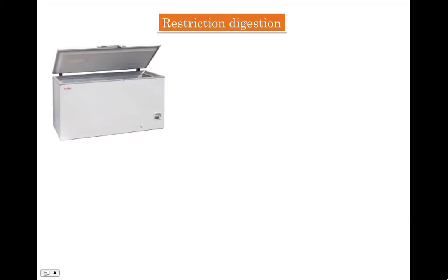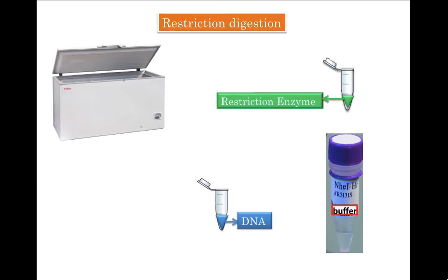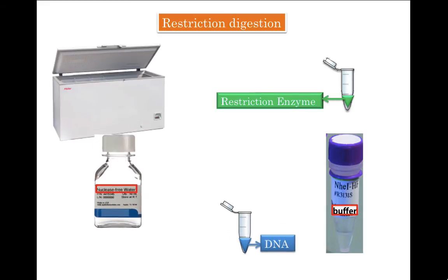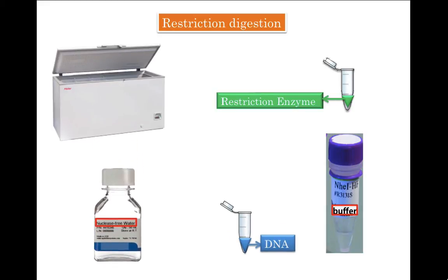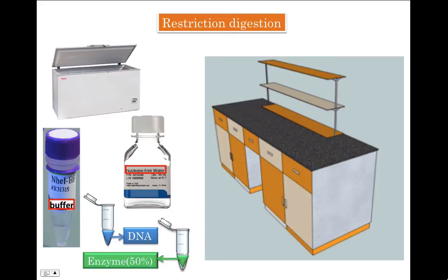Let's set up a restriction digestion — it's a very simple method. You need to open the minus 20 freezer and take out tubes containing restriction enzyme, restriction enzyme buffer, DNA that you want to cut, and nuclease-free water. Keep all the stuff you pulled out of minus 20 in an ice bucket. You need only two pieces of equipment: a microfuge and a water bath.